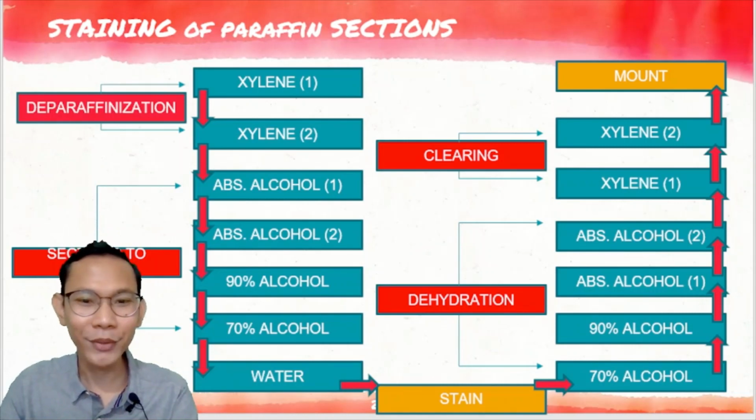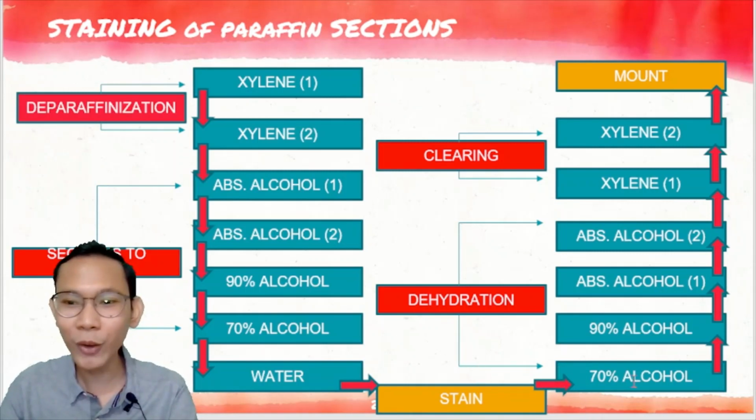Okay, perfect. So, staining. After staining, the section is again dehydrated with increasing grades of alcohol. So, parang binaliktad lang natin. So, this is now your dehydration, with increasing grades of your alcohol.